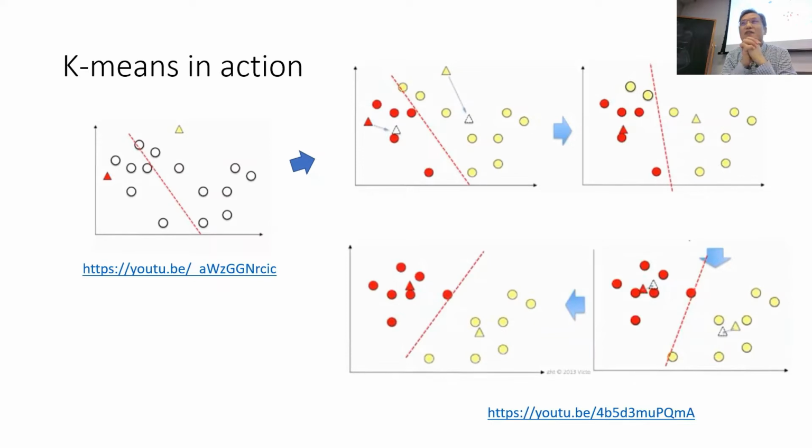Yes, for the single cell study here, we haven't yet talked about the cell type. So we don't know the cell type. We did a t-SNE embedding based on their distance in high dimensional space, reducing into 2 dimensions. So when they are close by, they maybe belong to the same cluster, same cell type.